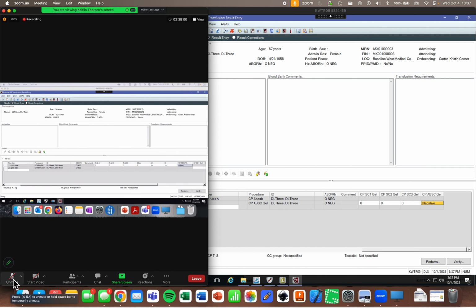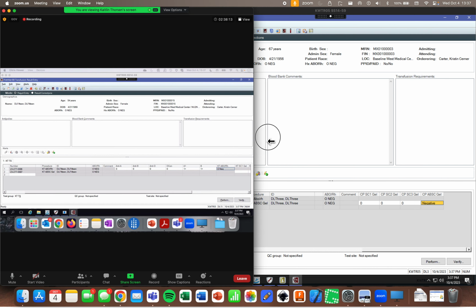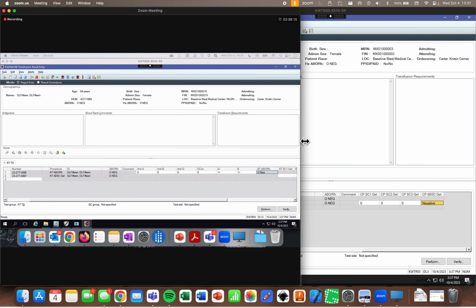It's not affecting whether the build functions, it just affects a little bit of the workflow. So at my lab, the interpretation for the ABORH doesn't automatically select itself. You have to do it manually. And I'd really like to change it so it's like how it is in here. That's the system generated versus the system validated.